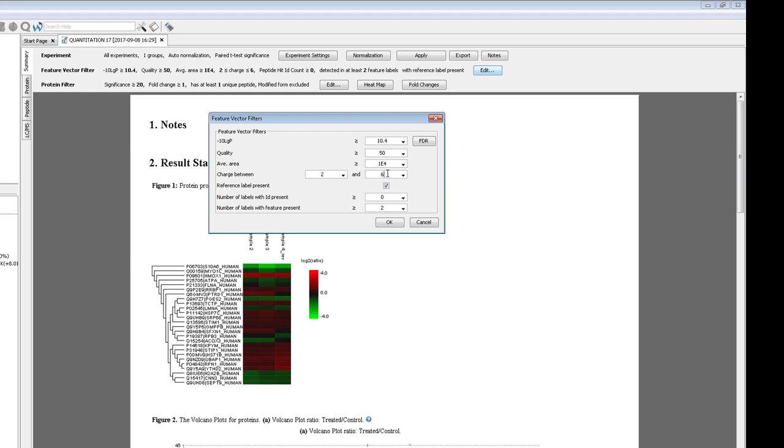You can also require that the reference channel be present, require MSMS identifications, or require that a certain number of labels are present for each peptide. Next, you can set the protein filters. The most important is the significance.